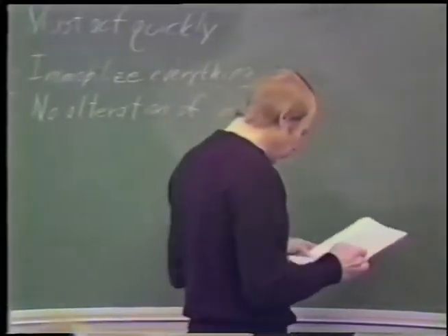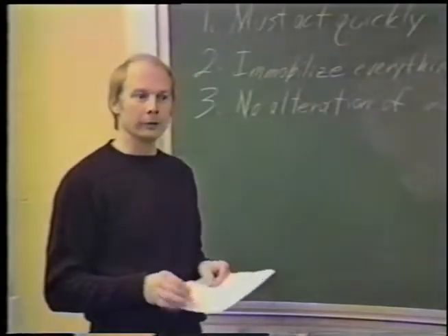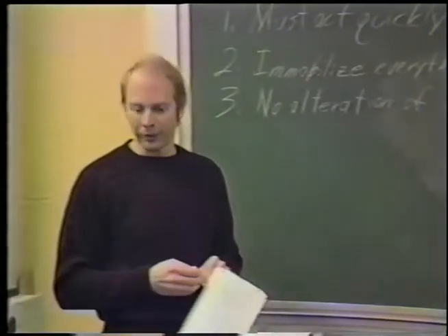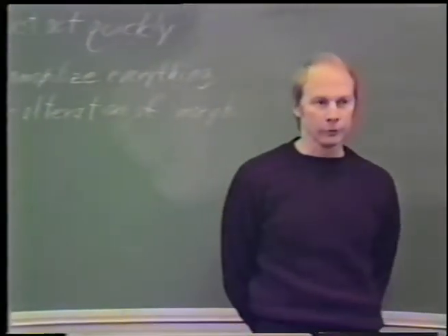Now, what is the physical state of the water in an ultra-rapidly frozen cell? And what is the rate of heat extraction that's required? What is the rate of cooling that's required in order to ultra-rapidly freeze cells? First, I'll define ultra-rapid freezing. I think that the best definition of ultra-rapid freezing is an operational one.